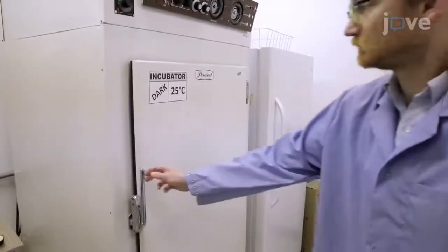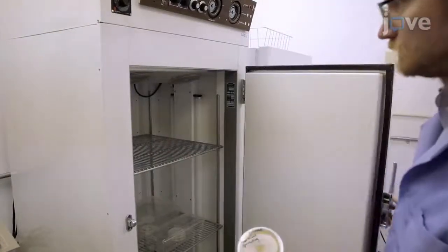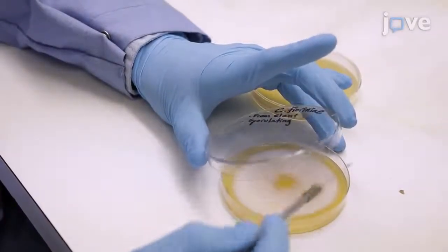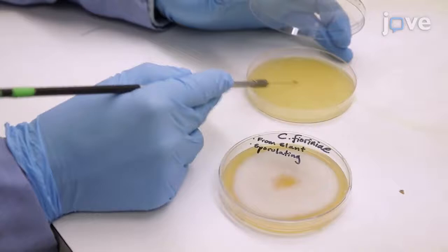Begin this procedure with a culture of Colletotrichum fioriniae from a naturally infected host, as described in the text protocol. When colonies begin to sporulate, streak conidia onto another V8 juice agar-containing cell culture dish to produce a high-density sporulating culture.